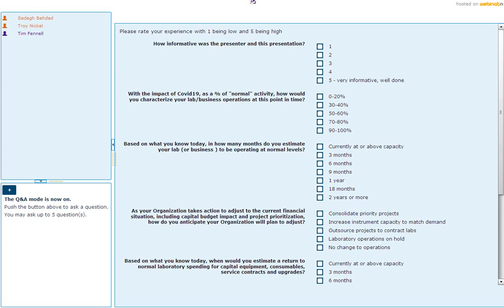In this case, we had an optical dilatometer. There is another version that is a push rod dilatometer. The main difference between what we presented today and a TMA is that here you don't have any contact. You can do contactless measurements. Sometimes you don't want to apply any load on your sample, right? So that's the added benefit of an optical dilatometer here.